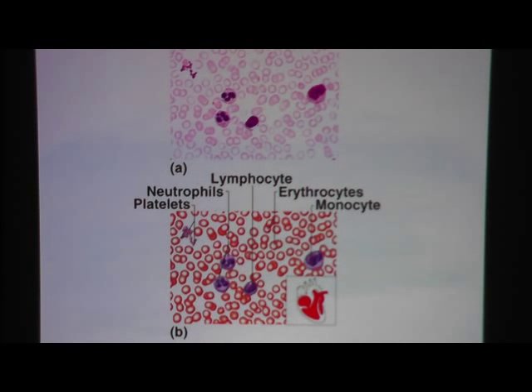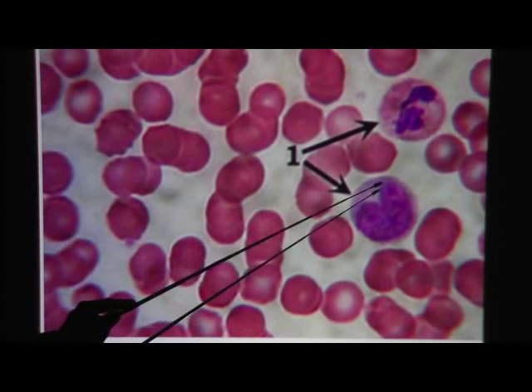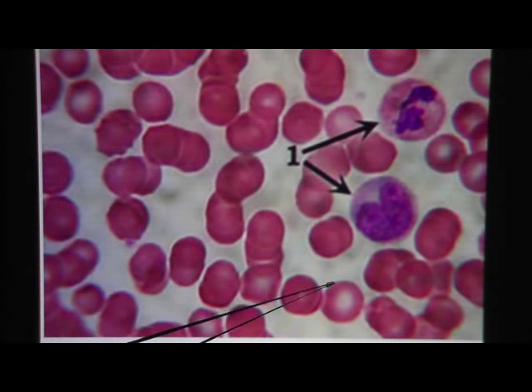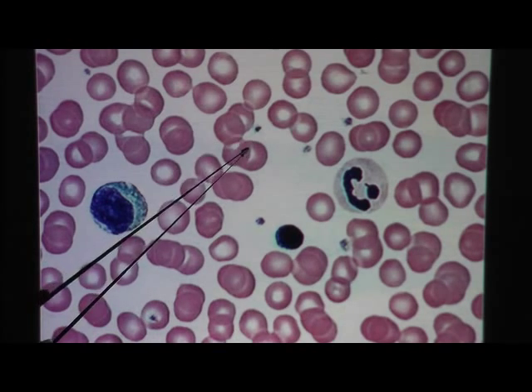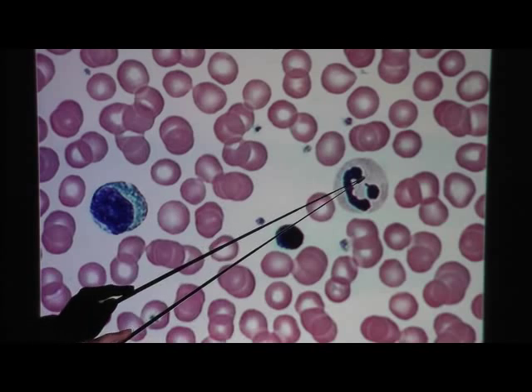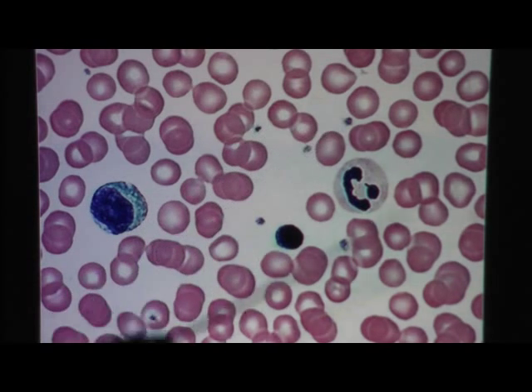And this is platelets. Here's high power. You see a lot of red blood cells. You see two white blood cells, and then all of this in between is plasma. Here's another slide of blood — red blood cells, and all the space in between would be plasma. We have several white blood cells in this slide, and we have multiple platelets.